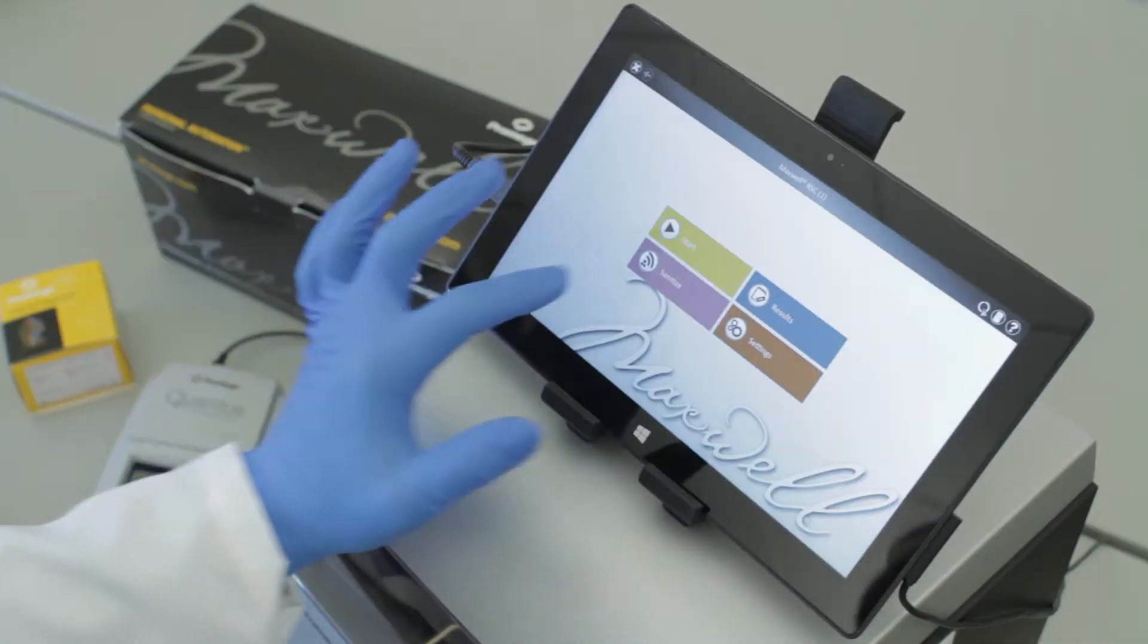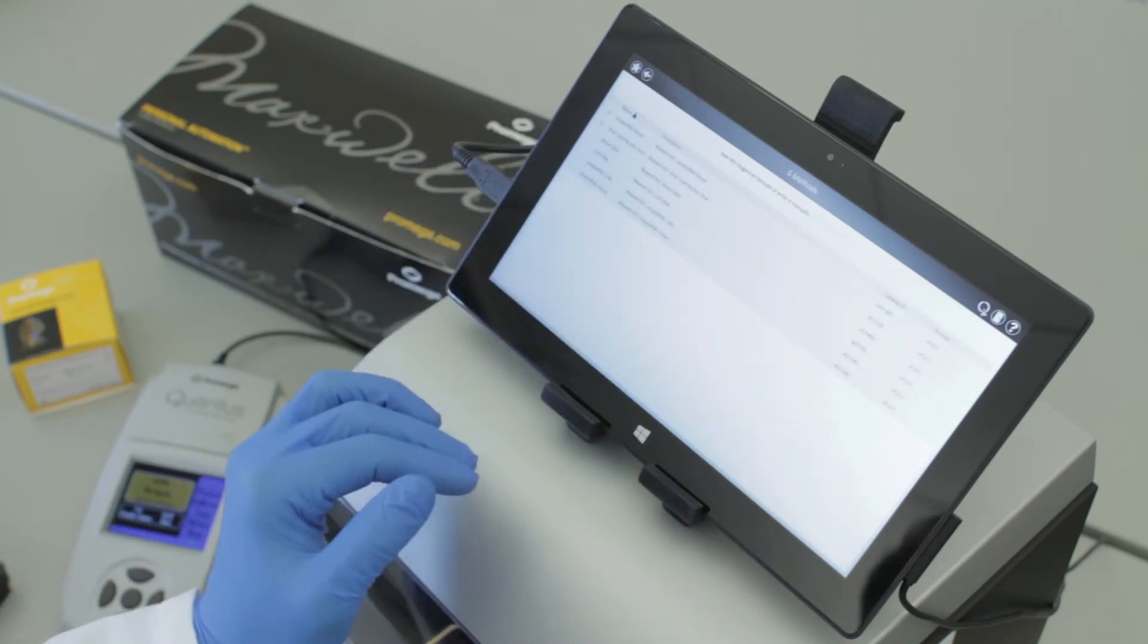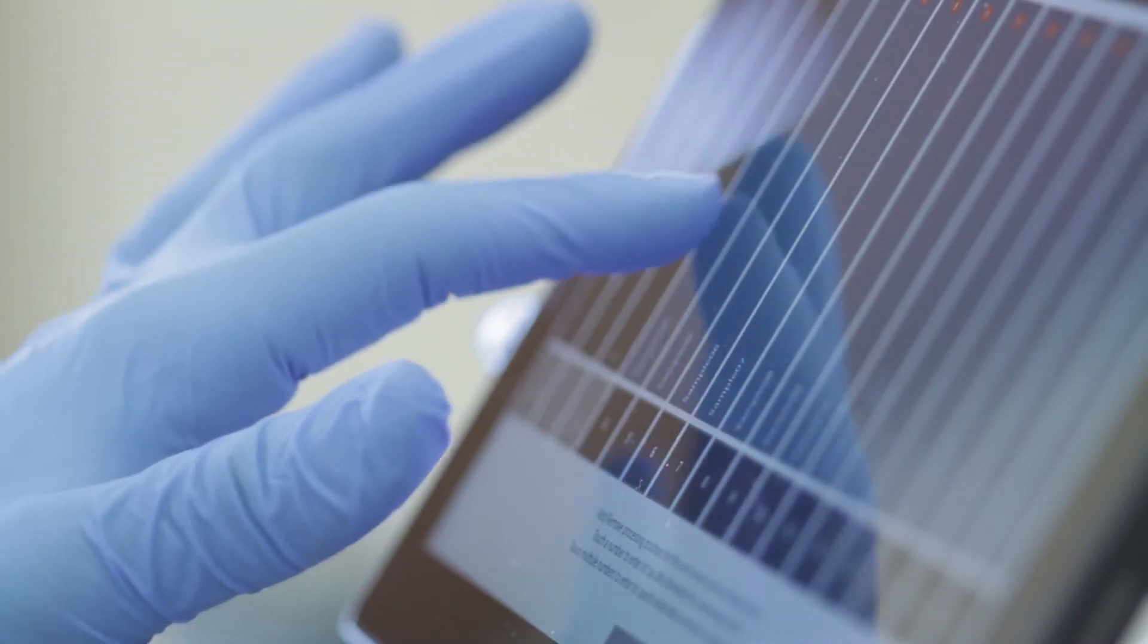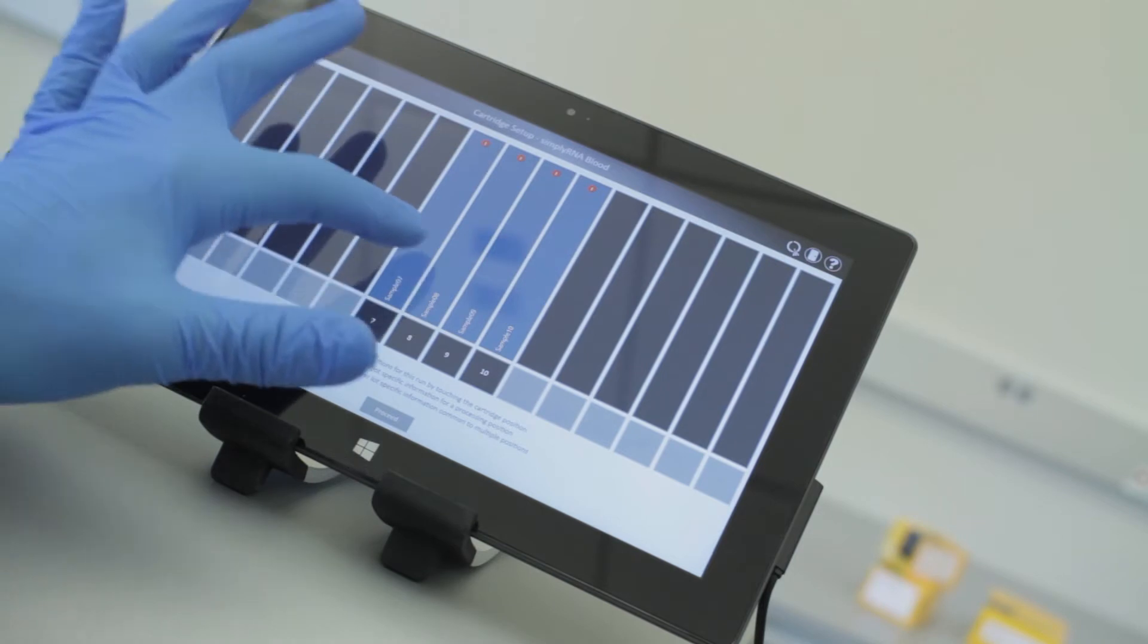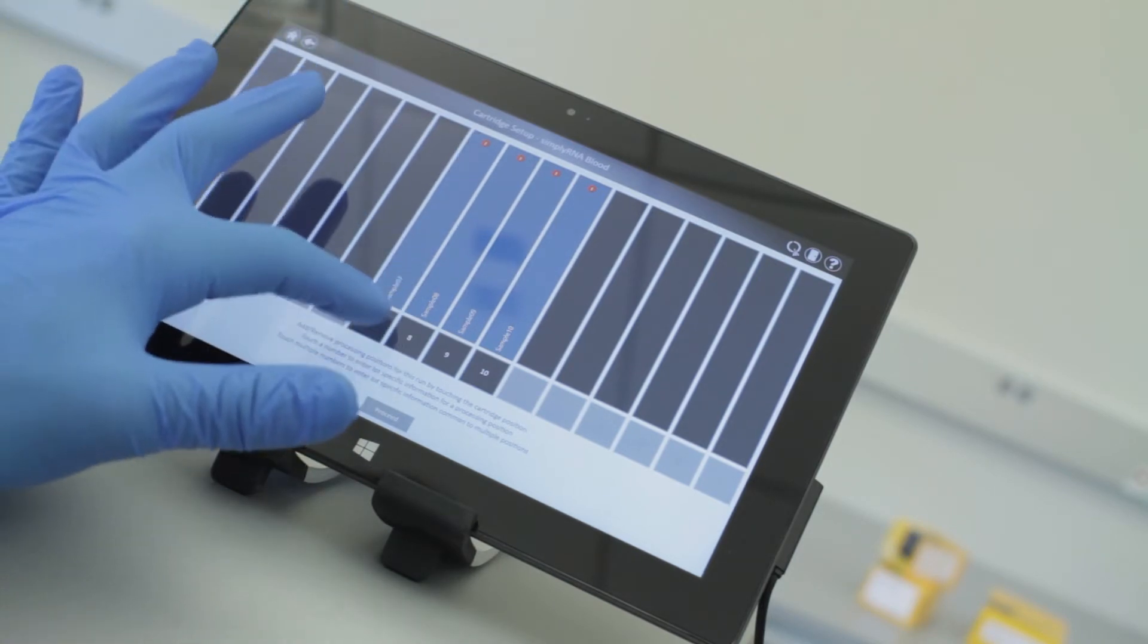The Maxwell RSC is easy to use. Walk-away purification at your fingertips. Using the touchscreen interface, you can select kit methods and integrate Quantus fluorometer quantitation data into your run reports.